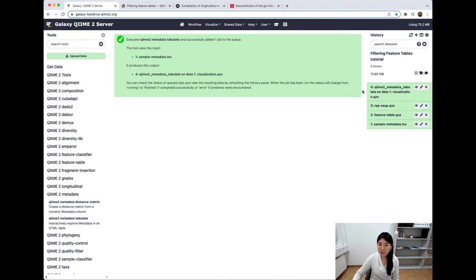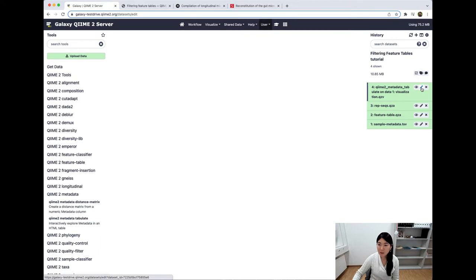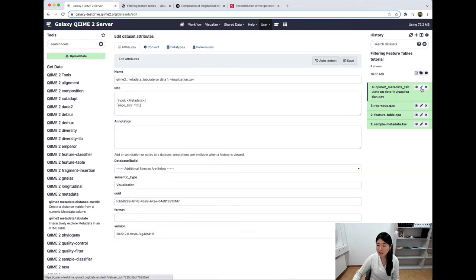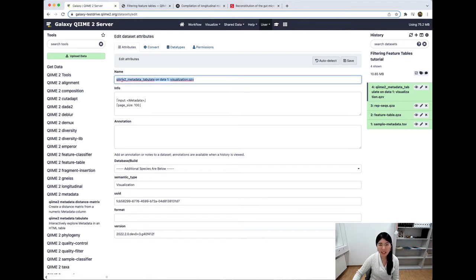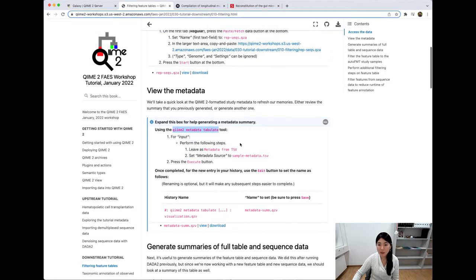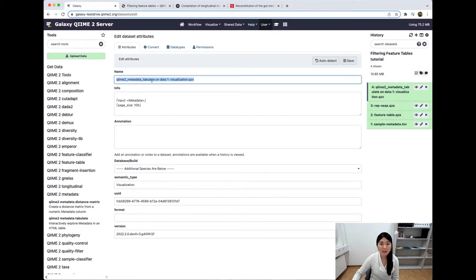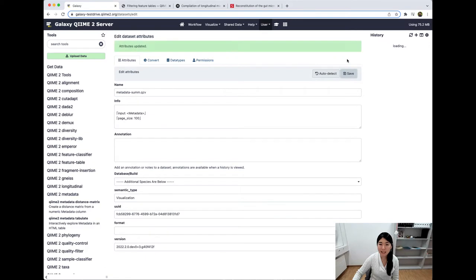Great, it's finished running. First thing we want to do is click on this little pencil to edit this file's dataset attributes. We want to rename this because right now it has an unfortunately long name. Our tutorial tells us that we want to name this metadata-sum.qzv — remember, the .qzv is for a QIIME visualization. So we'll copy and paste that in here and save.